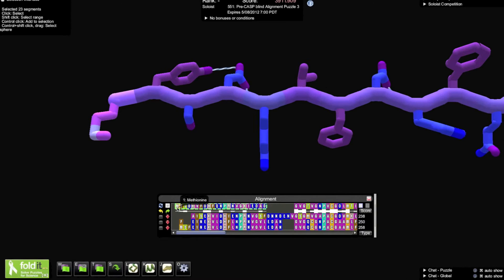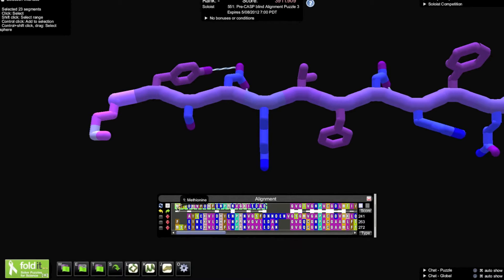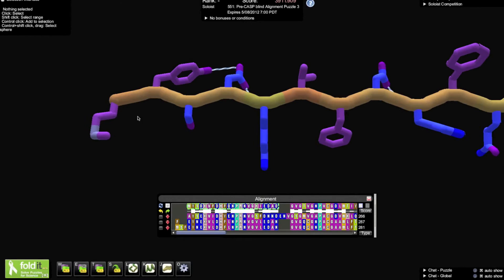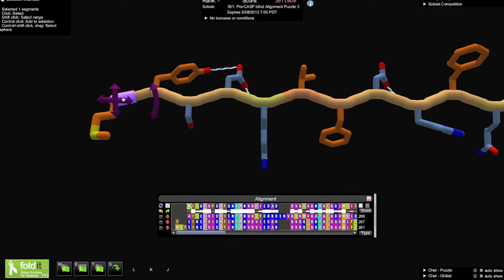Multiple amino acids may be selected at once, by using shift and clicking. Also note that as amino acids are selected in the alignment tool, they are also selected on the protein structure, and vice versa.